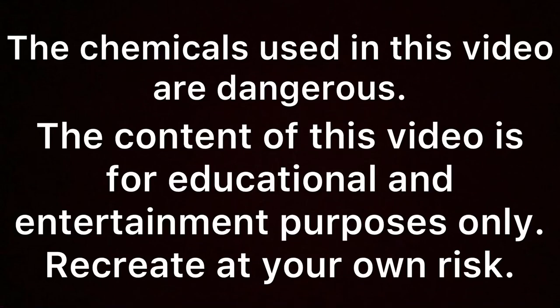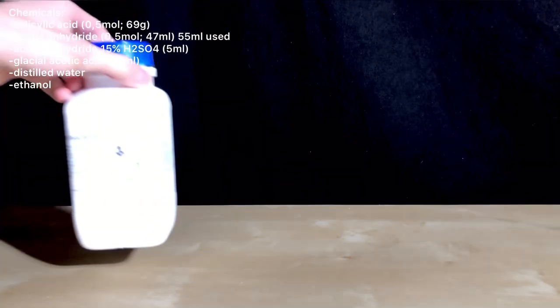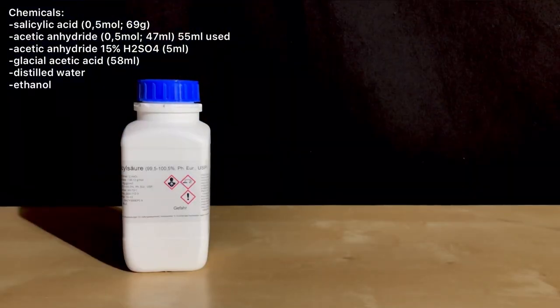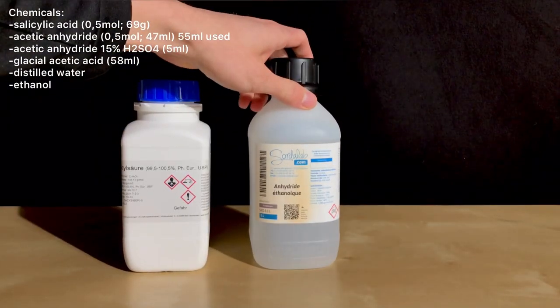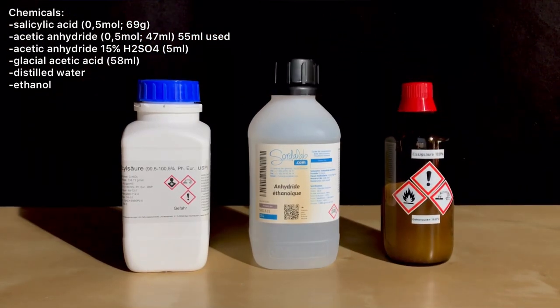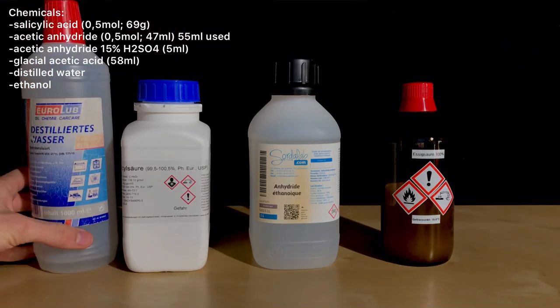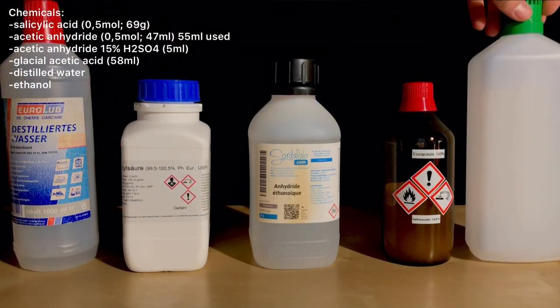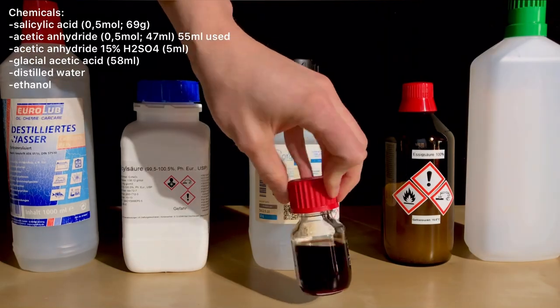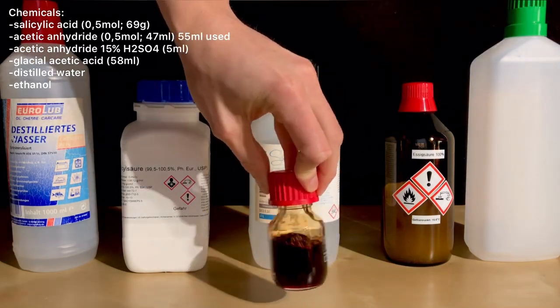Welcome back everyone. Today we are going to make some acetylsalicylic acid, also known as aspirin. For this, 69 grams of salicylic acid, 55 milliliters of acetic anhydride, 58 milliliters of glacial acetic acid as a solvent, distilled water and ethanol are needed. Besides that, we also used 5 milliliters of acetic anhydride containing a little less than 15% of sulfuric acid as a catalyst.